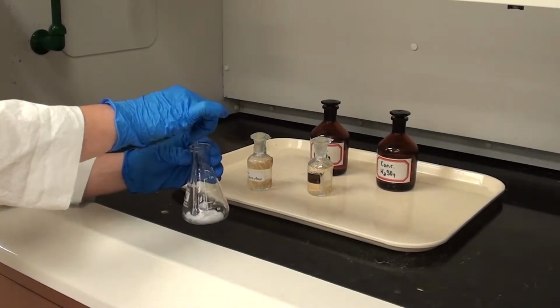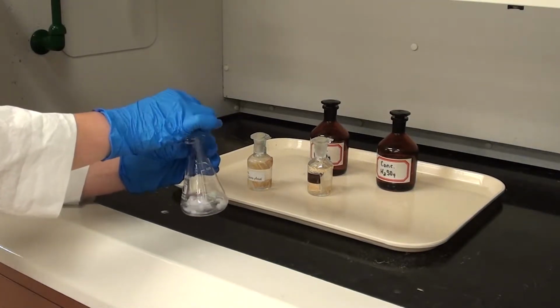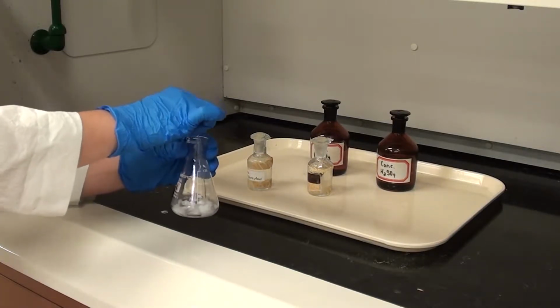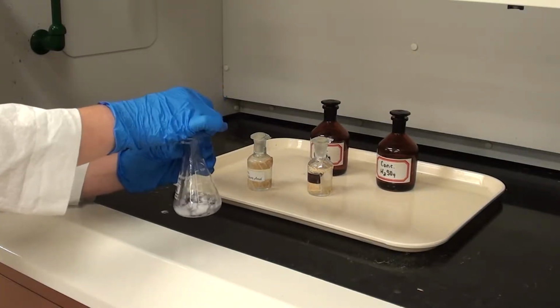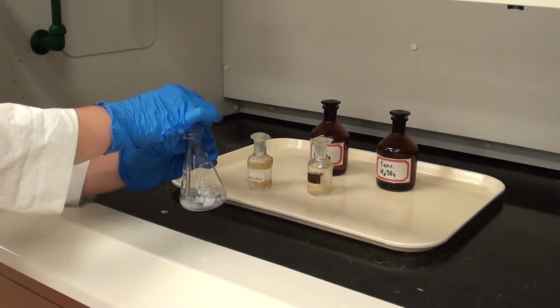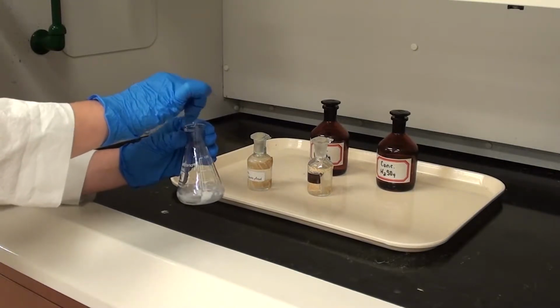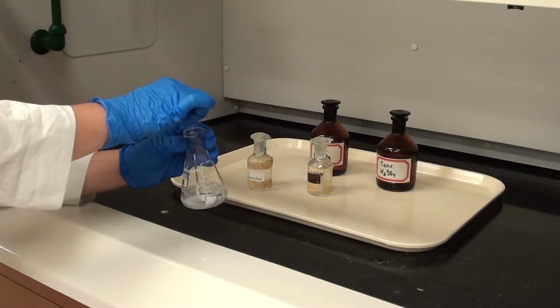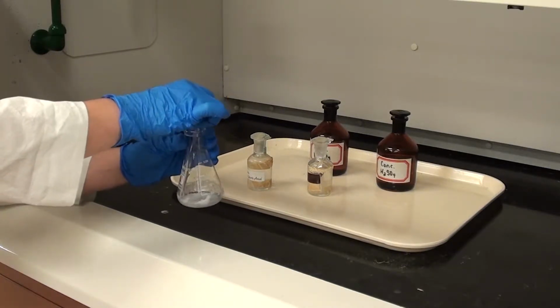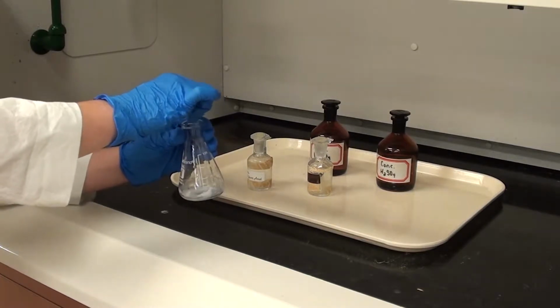Now what's going to happen is that initially the solution will turn colorless, and then at some point the aspirin will come out of solution. So that's all Cassie's going to do right now, is just stir it all up, see if she can make the solution colorless and completely clear, no crystals at all. And then hopefully that aspirin will come out of solution.